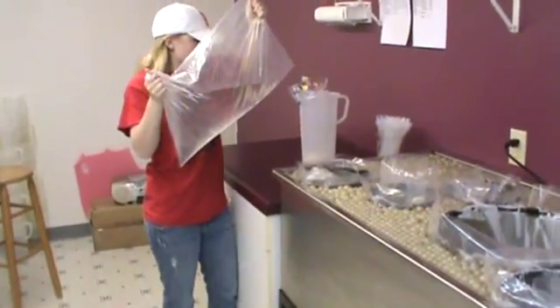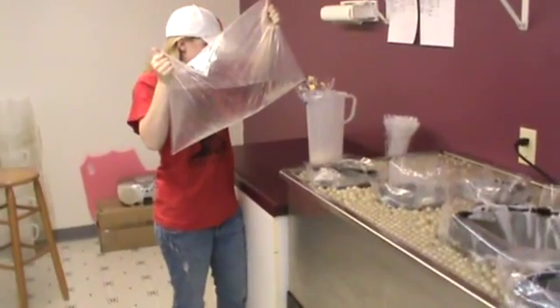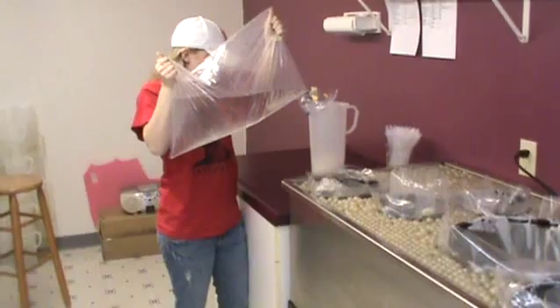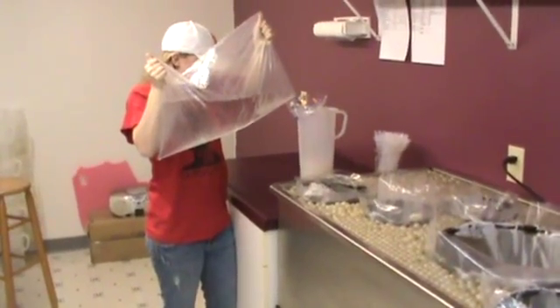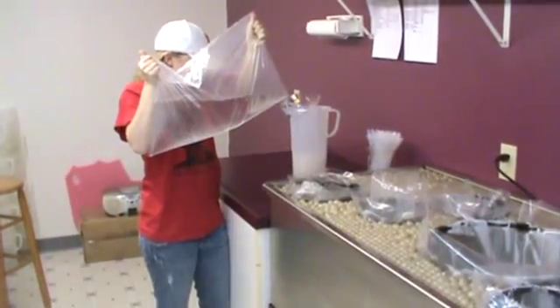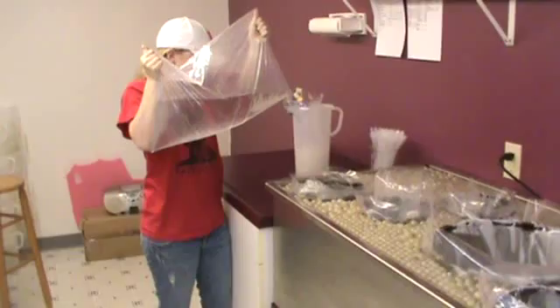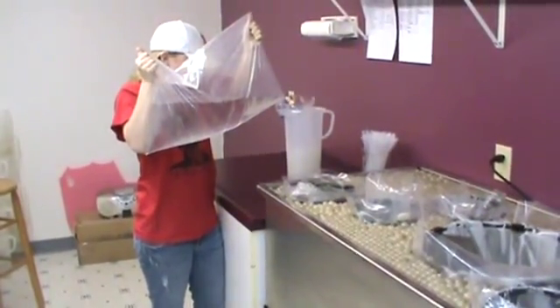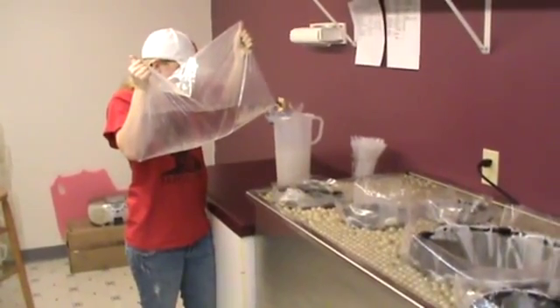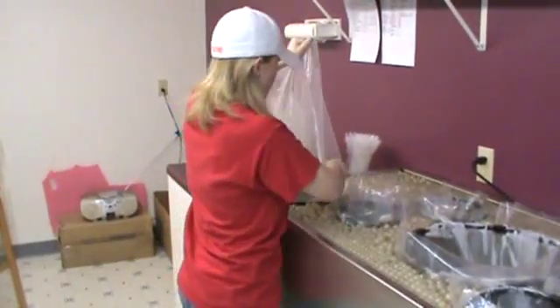She makes sure that the extender is mixed up and that it's not too much in one particular part of the bag. She is now pouring the extender into the semen that was just collected. Okay, that part is done.